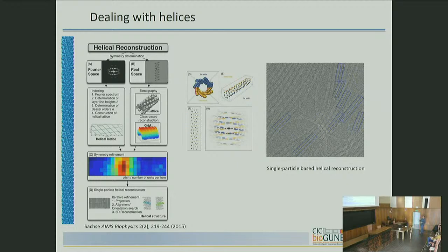But here, what we do is we select stiff, straight segments of those filaments, and then we chop them into different segments with different overlapping. This is something that you can play with, and it's not very relevant at this point. And then work with them as single particles, in the single particle approach we usually use in cryo-EM, and taking advantage, of course, of the helical symmetry. Helical symmetry is taken into account during the alignment, during the reconstruction, in all the steps. And it multiplies the number of asymmetric units that contribute to the final average you're going to calculate in cryo-EM.